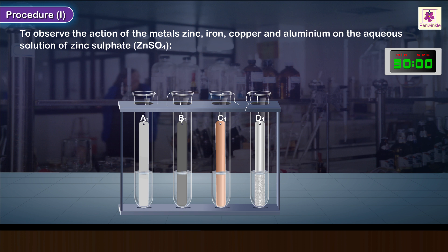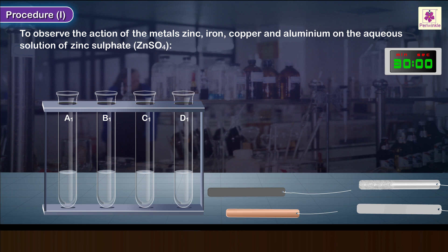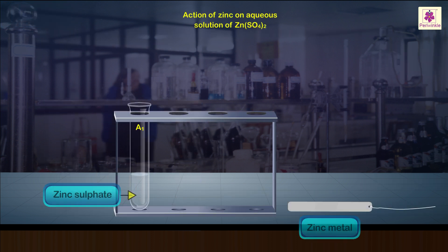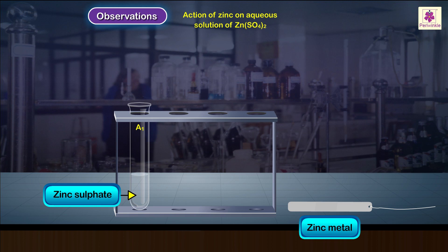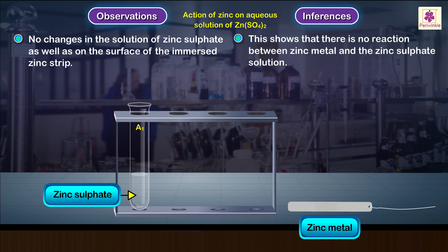Observe and record the changes noticed in the color of the solutions in each test tube. Carefully pull out each metal strip and observe the surface of the immersed part. Test tube A1 containing zinc metal — observations and inferences: no changes in the solution of zinc sulfate, and no changes on the surface of the immersed zinc strip.